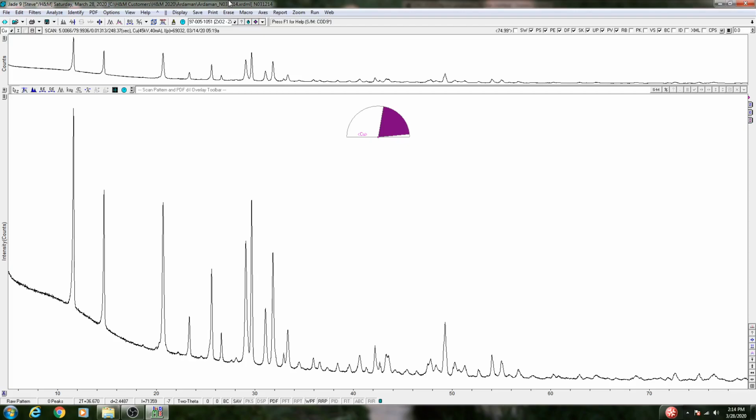Jade is the same package that is downstairs in the computer on the first floor in CCR. However, it's my understanding that we have a new version of it, so it might look a little bit different. But all the terms should probably look the same. So anyway, like I said, this is a real customer file that I've opened up.